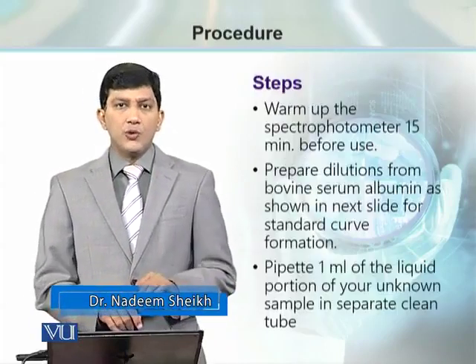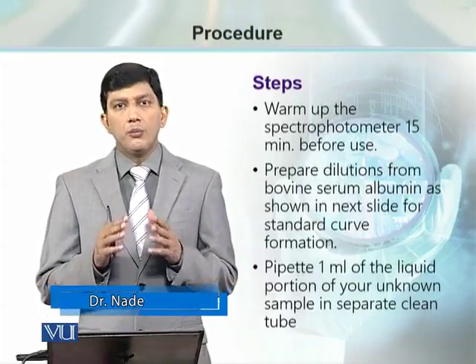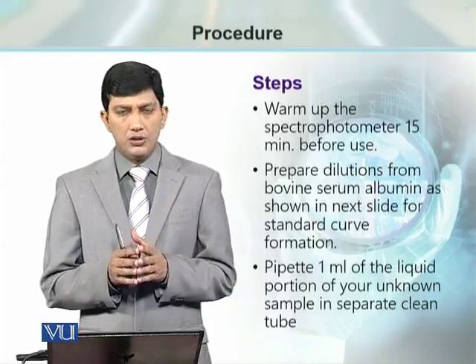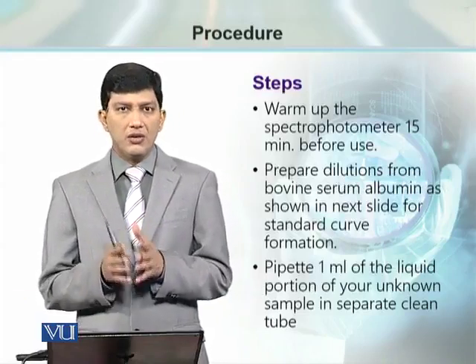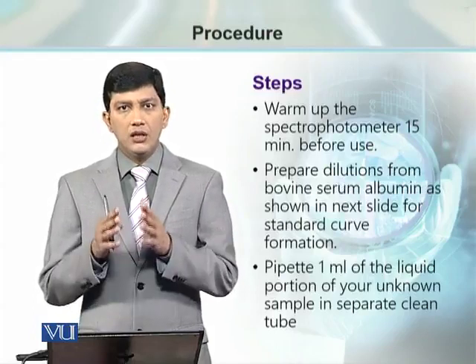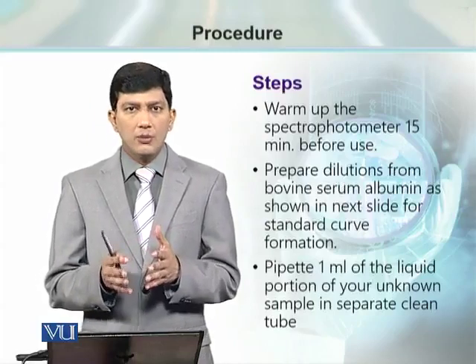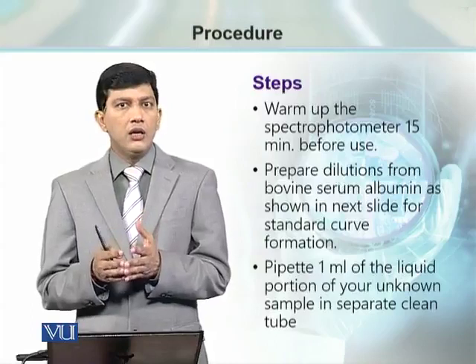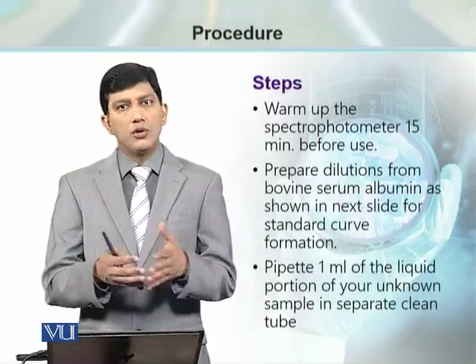As we have to use spectrophotometer towards the end of this assay, it is always recommended to pre-warm the spectrophotometer. अब स्पेक्ट्रोफोटोमीटर को 15 मिनट पहले स्विच ऑन करना मैंडेटरी है ताकि उसकी जो एब्जॉर्बेंस वैल्यू है दैट शुड बी द एक्चुअल वैल्यू, अदरवाइज there could be some problems in the absorbance values which are given by any spectrophotometer which is just switched on as you are going to use it.